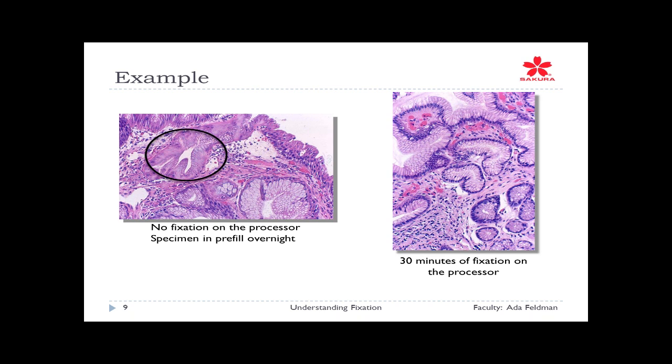just because it sat in the specimen container for hours and hours, you're not getting maximum fixation there. Because she really didn't have the 20-to-1 volume optimal, and it was sitting in used fixative all that time. So think carefully on how the freshness of your fixative applies here.